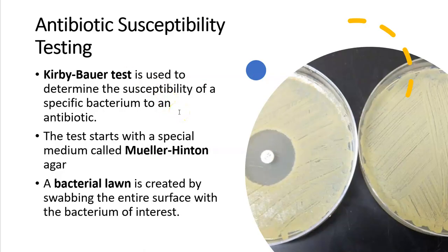So what we typically do is we test to see if an antibiotic is going to be effective at curing an infection. A lot of times doctors and nurse practitioners and PAs will know from experience what the causative agent of an infection is and what antibiotic works best, so they're not necessarily always running to the back and doing a Kirby Bauer test. But in situations where it is unknown what the best antibiotic choice would be, the Kirby Bauer test would be highly beneficial.